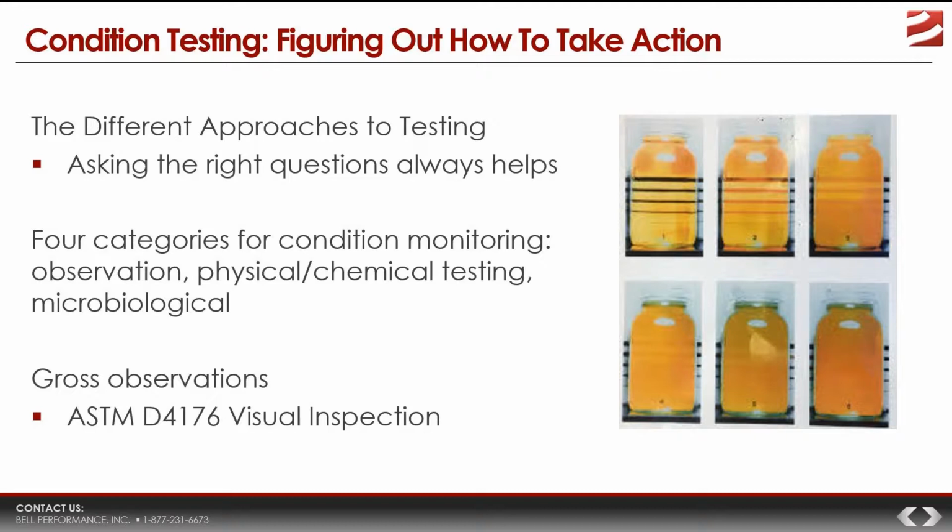You pull a fuel filter or a tank filter, and you look at the filter media, and you see a coating on there. Most of them are going to have coatings, but what does that coating feel like? Does it feel like kind of a dry particulate, or is it kind of slick and slimy? Those kind of things. Those all go into gross observations.